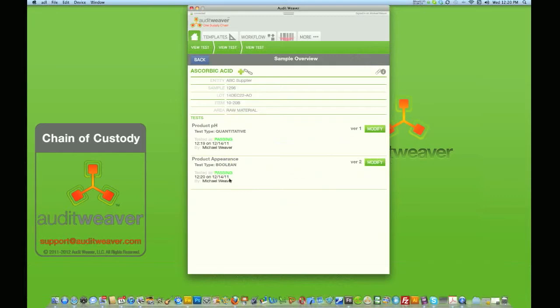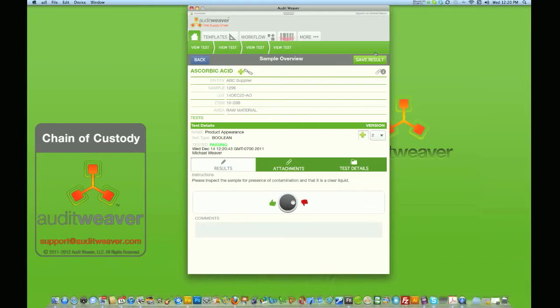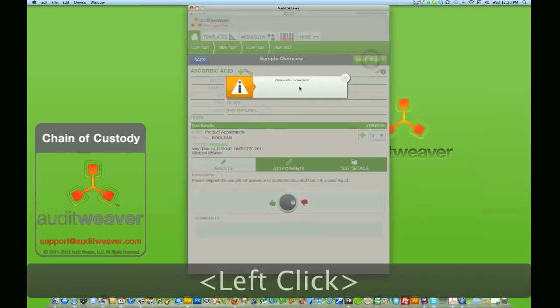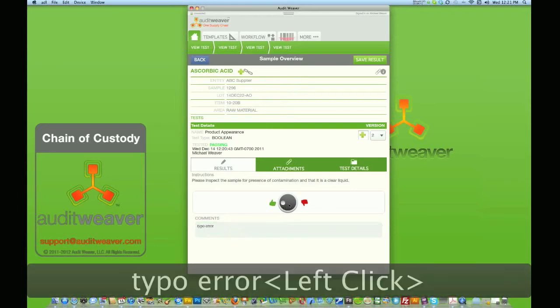Maybe I did a typo on that. I'll go in a second time. There's really no limit to the versioning that you can do here. Let's say that I just try to save this. It'll say, oh, please enter a comment. So enter in typo error. It actually failed.